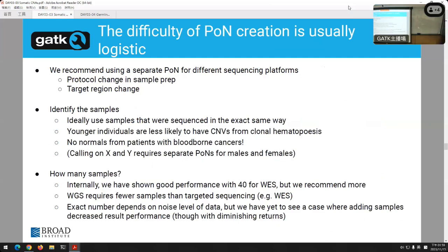One is people had asked, I think Aaron earlier, what about chromosome X and chromosome Y? That's really important with copy number, because chromosome X is very different in males and females, and chromosome Y is very different too. We don't often call chromosome X and Y, it's complicated. We don't know in our sequencing pipeline what the gender of the samples are, and we don't want to make assumptions either, because we can't just look and say, oh, it's copy number 2, because they're all somatic.